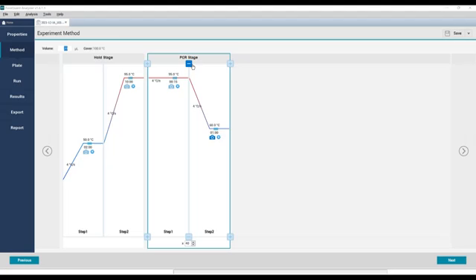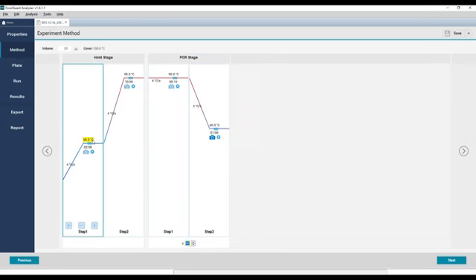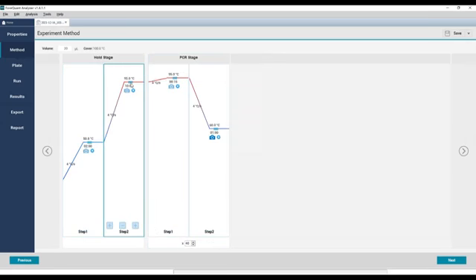If you want to add or remove a reaction step in a certain stage of PCR, you can move the mouse over the step area and click the Add or Subtract button. The left and right Add buttons represent adding a step before or after this step. The middle Subtract means removing this step. The reaction temperature, time, and the number of cycles can be increased or decreased by inputting numerical values in the numerical value area, or clicking the up-down buttons. The temperature setting can also be changed by clicking and dragging the temperature curve.